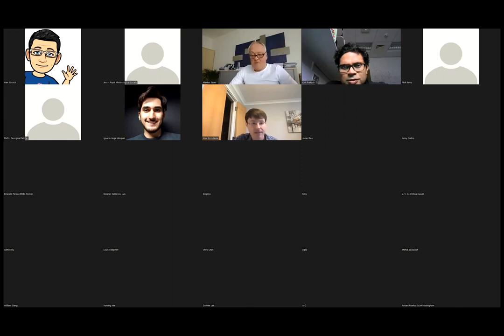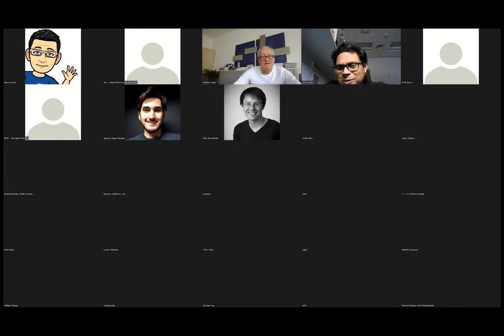You're welcome. Sorry, Markus, I will just take one last question which popped in, which is from Johanna. She wants tips on how to attach gel to the slide during imaging. Say it again, please. Can you repeat it? So she has trouble attaching the gel to the slide during imaging. Do you have any tips for her? Oh, yeah. We silanize the coverslips, for example.